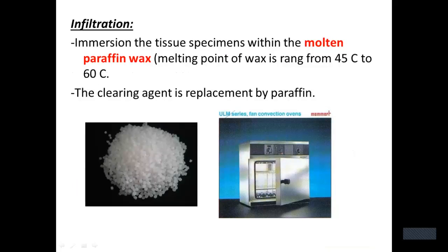Infiltration means immersion of the tissue specimen within molten paraffin wax. The melting point of this wax ranges from 45 Celsius to 60 Celsius.